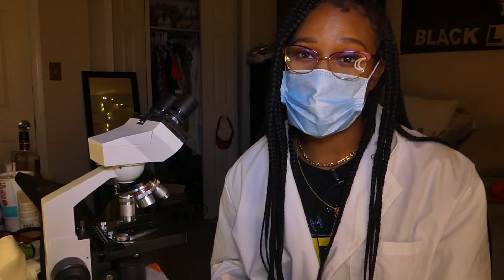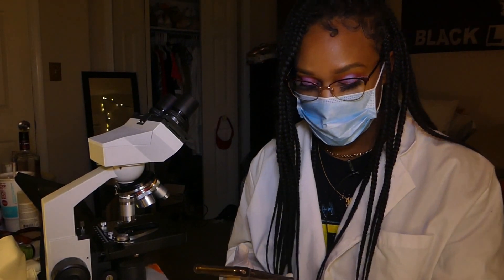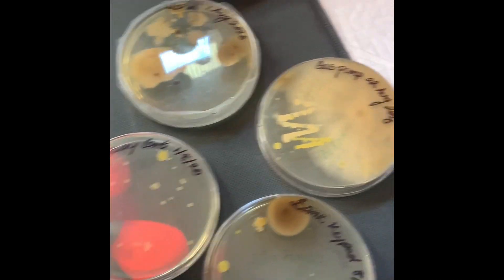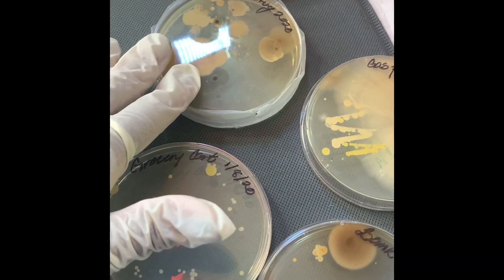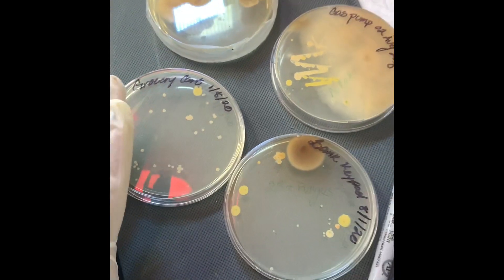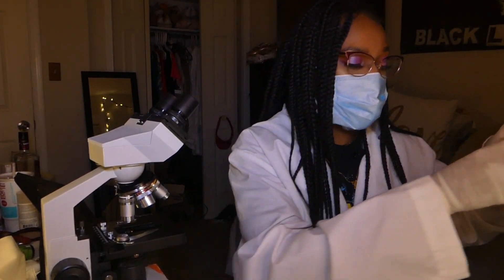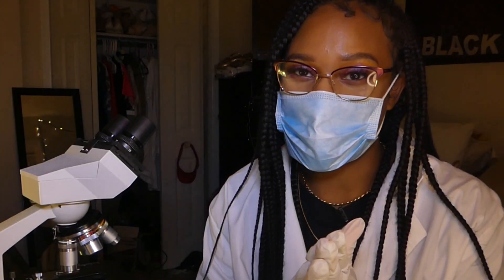Kids are nasty — if you're debating whether to have kids, just saying. I'm going to put everything together so you can see them side by side. In conclusion, the grocery cart and the bank keypad are slightly cleaner than the gas pump and the toddler's hand. However, I hope this makes you realize, especially during this pandemic, just how dirty things are that people are all touching. You really have to make an effort to use hand sanitizer and always have it on you, but not only hand sanitizer — you need to wash your hands.